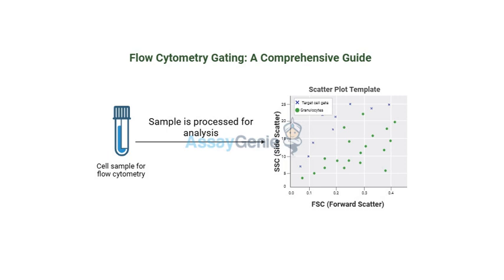And that's where dimensionality reduction comes in. It takes all those dimensions and squishes them down into something we can actually see, like 2 or 3 dimensions. Oh, so it's like making a simple map of a really complex area. We might lose some details, but we get a better overall view. Yeah, that's a good way to think about it.